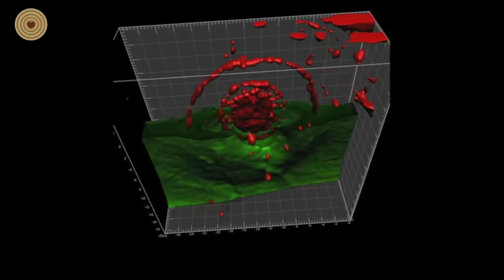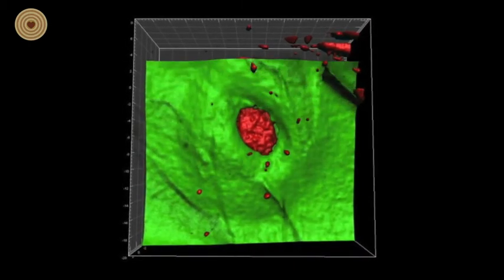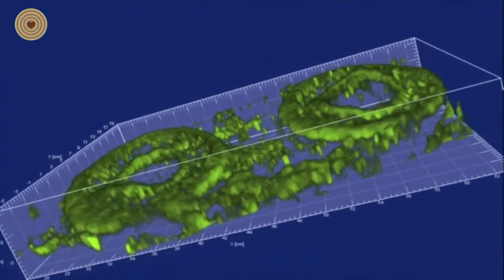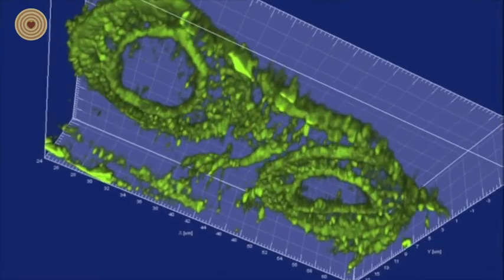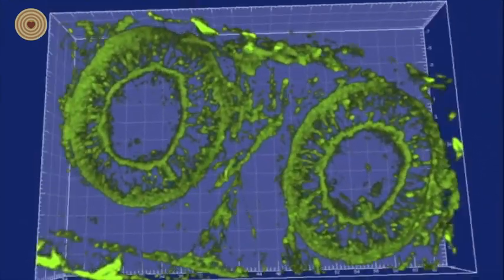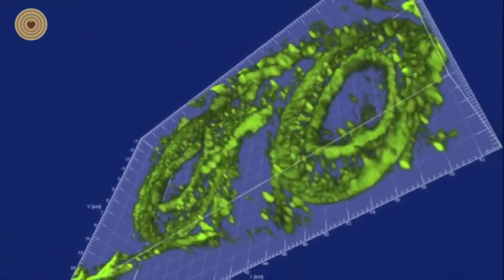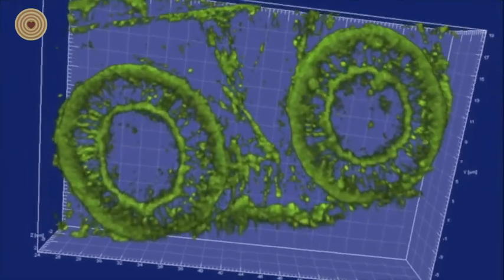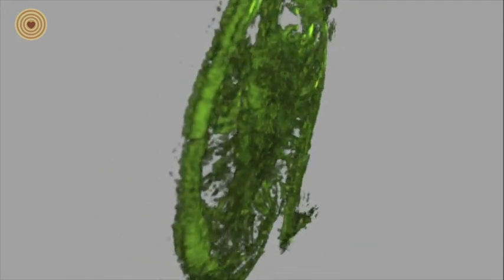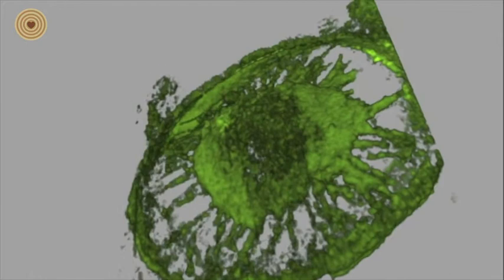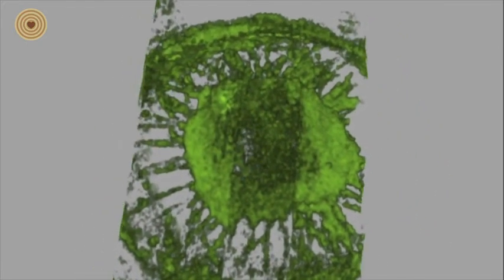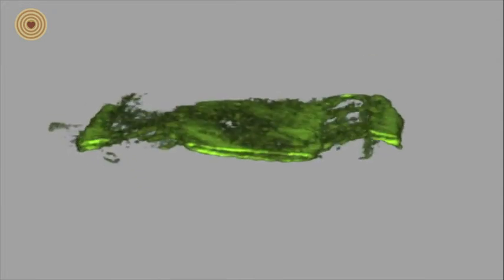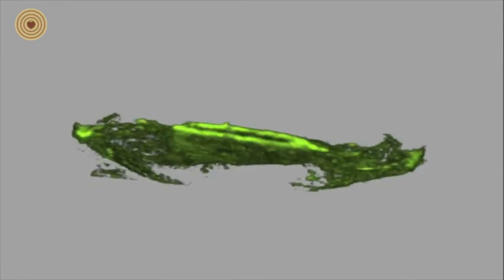In these clips, we are viewing bordered pits in both the aspirated and unaspirated form. One of the things that viewing the samples at this high level of magnification allows us to see is how the pectin is able to shift position during the aspiration process to become redistributed as the pit undergoes aspiration. In some of the earlier images, we could see how the pectin actually molded to the bordered pit aperture, or opening during the aspiration process, allowing that pit to be fully sealed to prevent sap flow. A never-before-seen feature that we were also able to see by imaging cellulose only was a small pocket or hole in the interior of the torus of the bordered pit, which in the living tree contains fluid. The fluid appears to help maintain the structure of the pit membrane until a point in time when pit aspiration may occur.